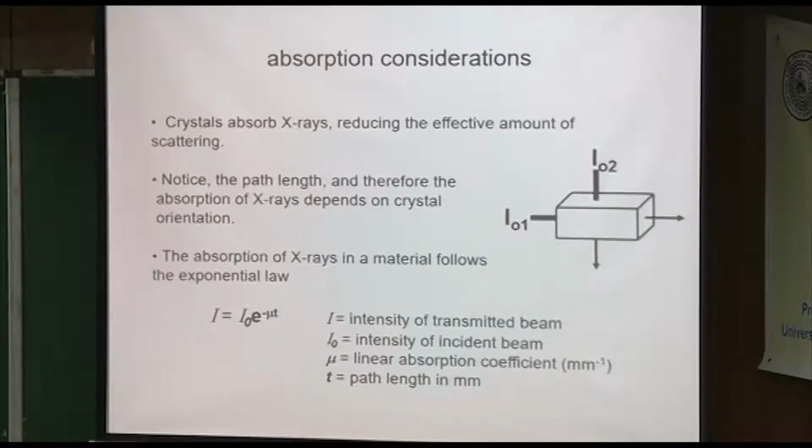So absorption is one of the problems that you encounter. And although absorption is, again, sort of a physics problem, it's pretty easy to imagine that X-rays go into the crystal, and if the atoms have an absorption edge that is high at that point, before the X-rays can exit, some of them are going to get soaked up, and the intensity will be less when it comes out the other side. It's not in here, right? It's just right out the window.